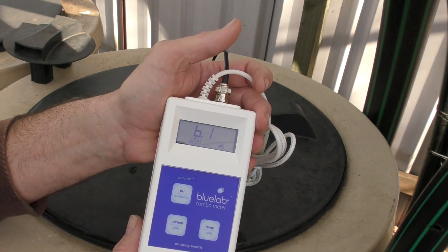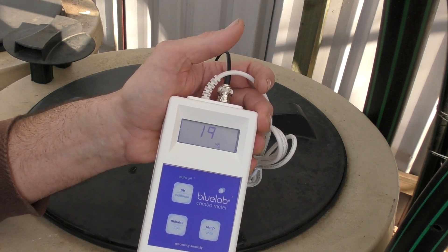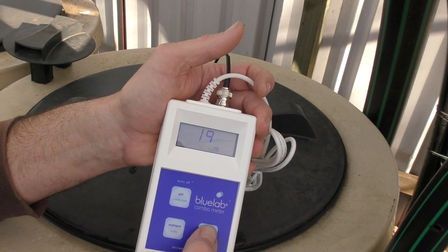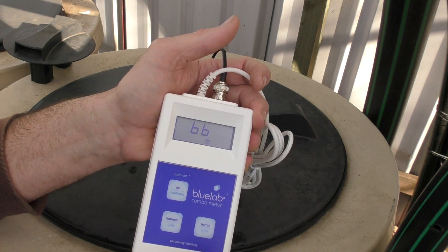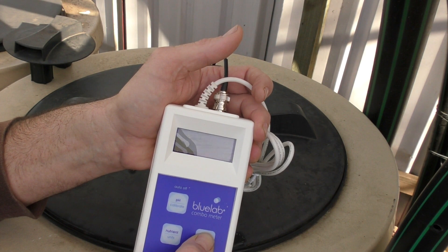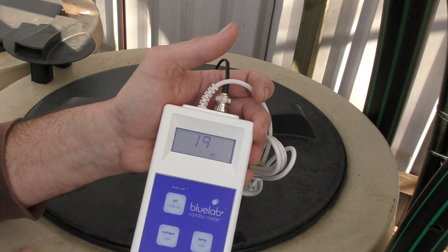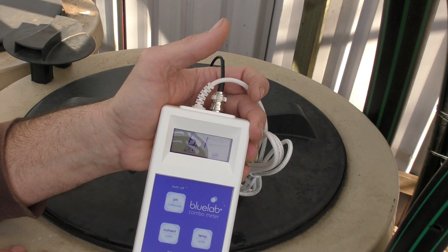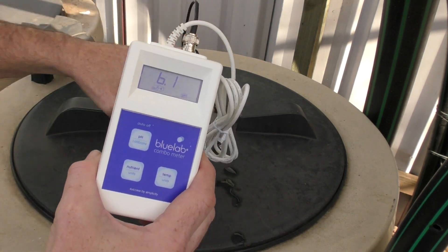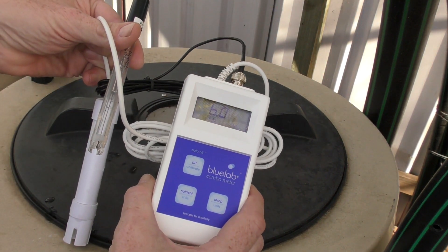It looks like we've got 6.1 — I definitely need to pop some calcium hydroxide in there just to boost it up a little bit. Now to go to temperature, all I need to do is press that button. It shows me the water temp is 19 degrees centigrade, and if I press it again it tells me it's 66 Fahrenheit, so I can go between the two. One thing I didn't mention before — this little jobby isn't waterproof, so I've got to make sure it's nice and dry before I put it away, and if I do drop it in water it needs to be dried off straight away. It settled down to 6.1 — there's a little look at the meter in action. It turns itself off, so I just need to pull out the probes, rinse them in some clean water, pop the little cap on, and away we go.